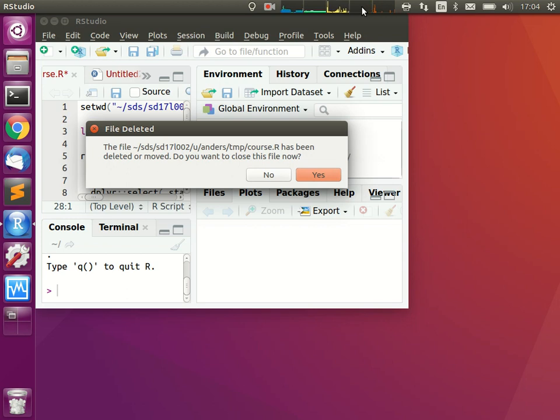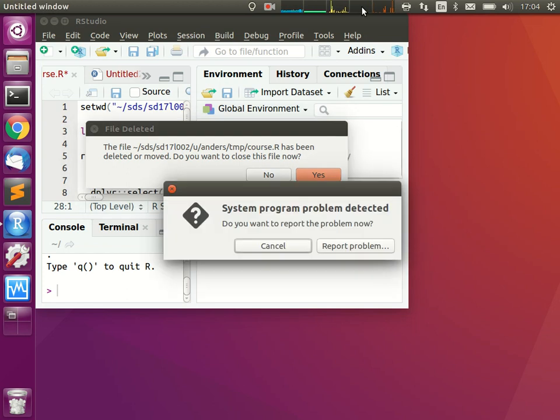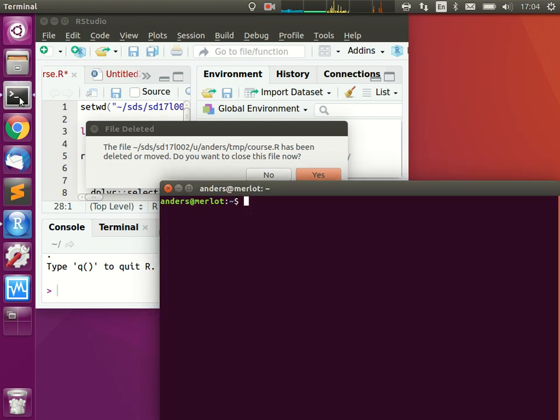Okay, so for today, I thought I'd go a bit more through RNA-seq, maybe go through the stuff we did last time, recap a bit what we did, because that was a lot, and see how far we get this time. I have to admit the things are not that well prepared as I would have hoped, because this week was a bit too busy, but let's see how things work. So, to remind everybody what we did.